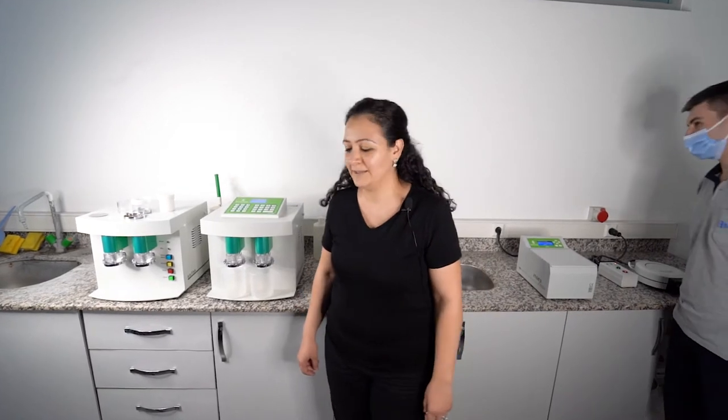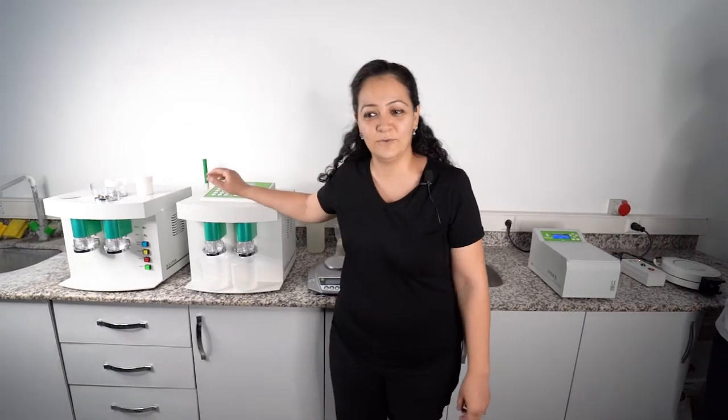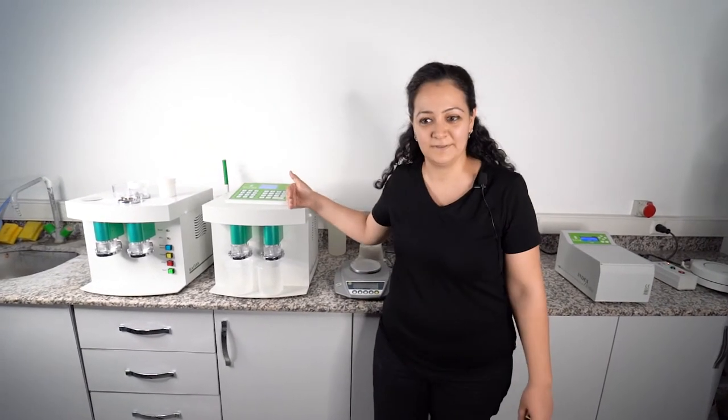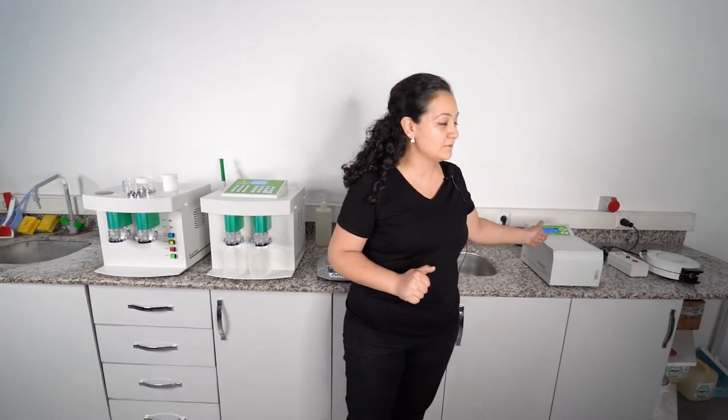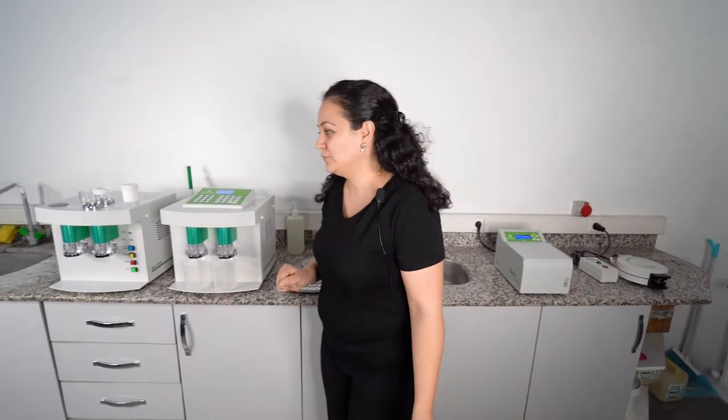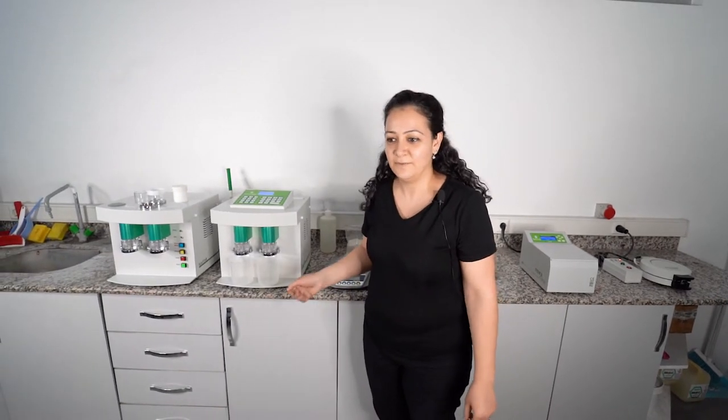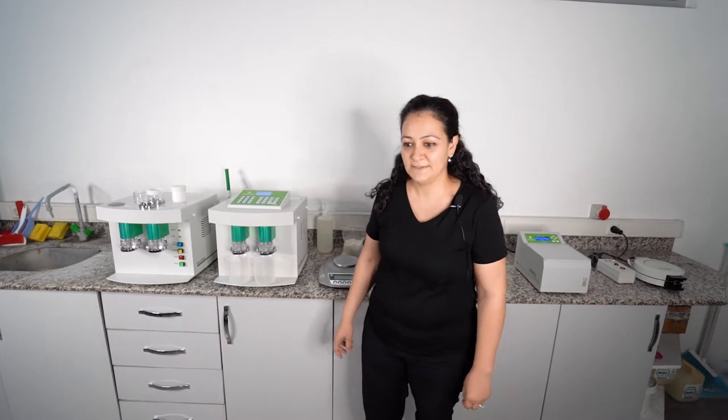Hello everybody, today we will make training about the gluten washer system. We have two different kinds of gluten washer: 6000 model and 6100 model. We will also introduce our 2100 gluten index and gluten dryer 2500 model. We will do the test together for wheat flour. First, I will explain what is gluten. Gluten consists of gliadin and glutenin proteins. It is a special protein for wheat flour that gives elasticity to bread and bakery products.